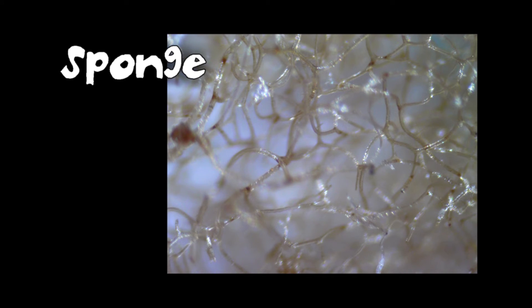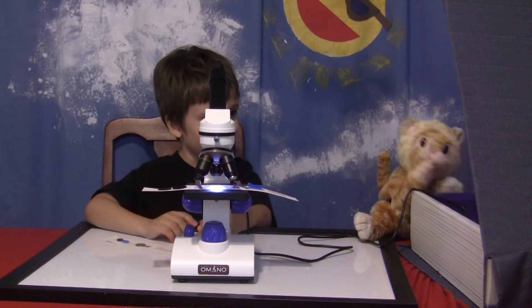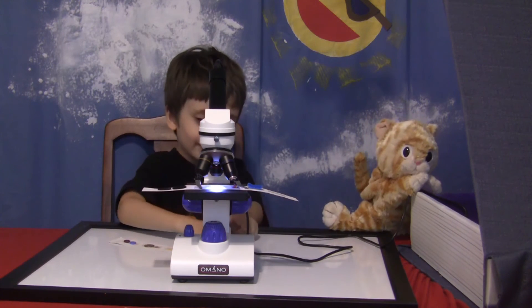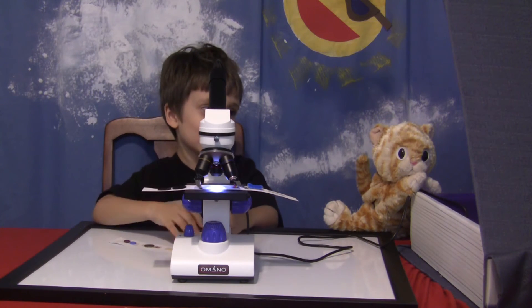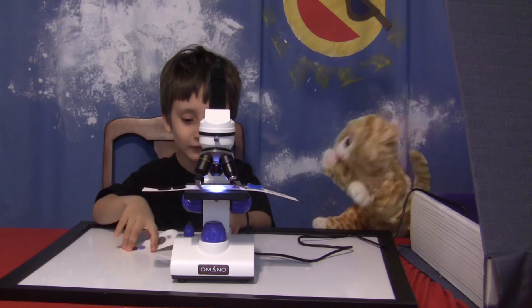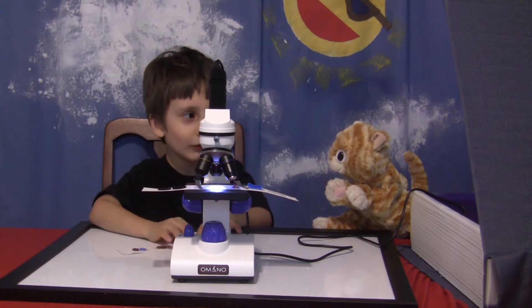Let's see what a sponge looks like. Doesn't it look like wires? Yeah, it's like the inside of a robot's brain. That's probably Ultron. That might be Ultron's brain. We should destroy it before we kick out of hand. Oh look, that looks like outer space. It's actually kind of pretty.